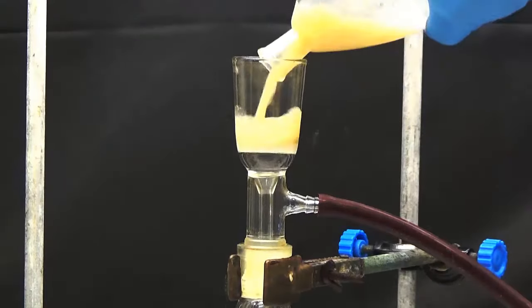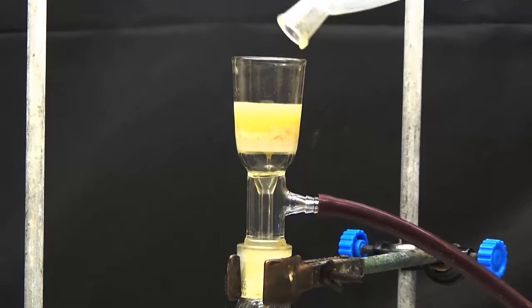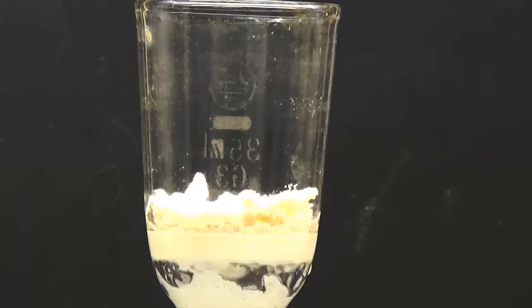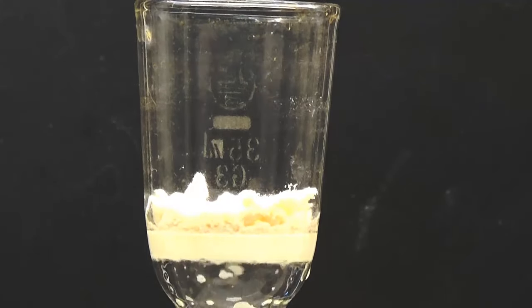Collect the amygdalin by suction filter. Repeat the extraction with 10 milliliters of ethanol and precipitation with 5 milliliters of ether until no amygdalin precipitates.